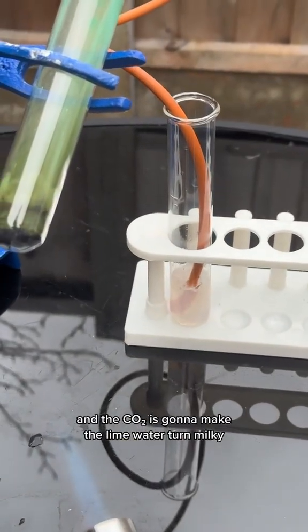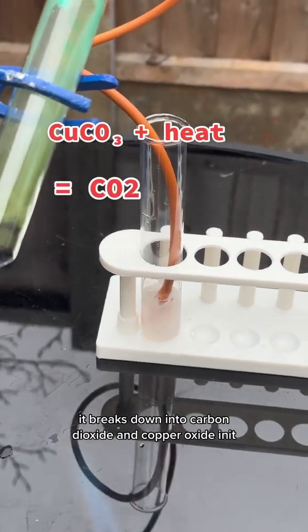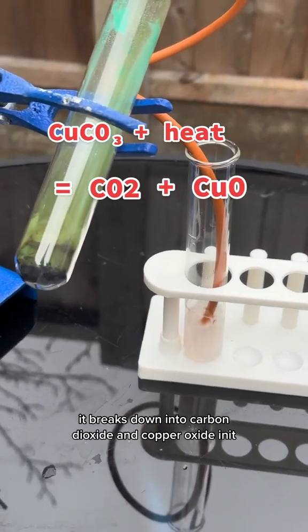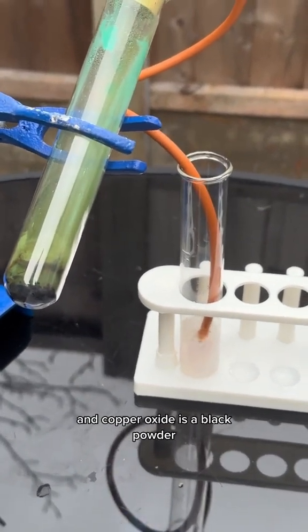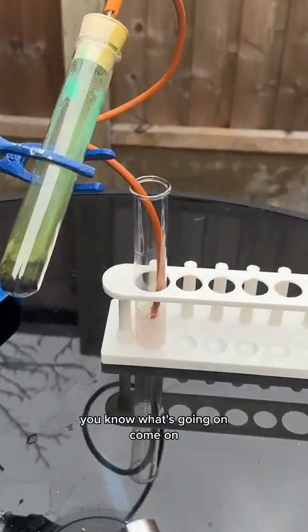As we can see, when copper carbonate is heated up it breaks down into carbon dioxide and copper oxide. Copper oxide is a black powder, so that's why the copper carbonate in the boiling tube has turned black — because copper oxide was made.